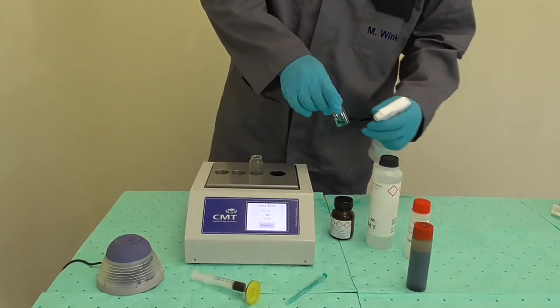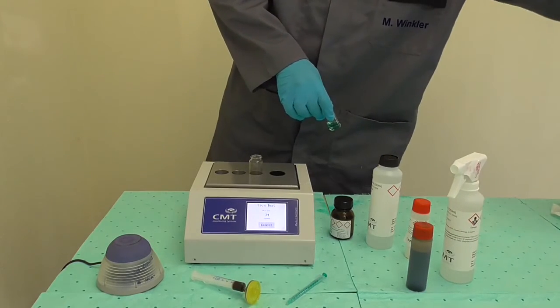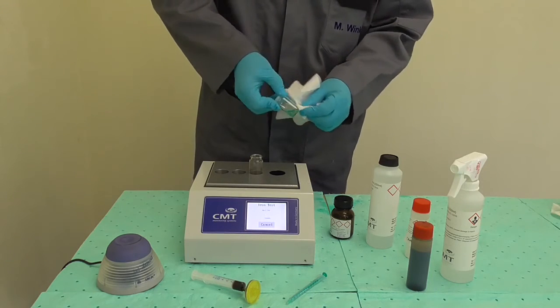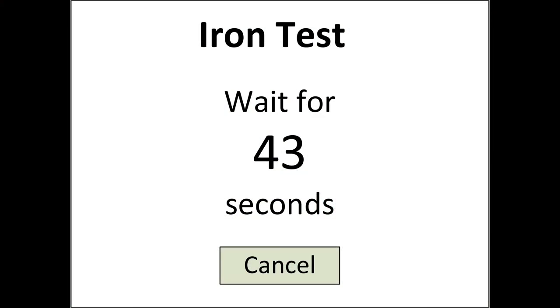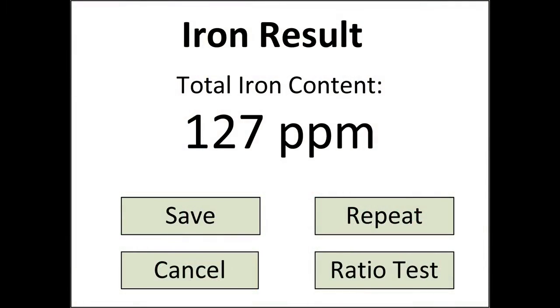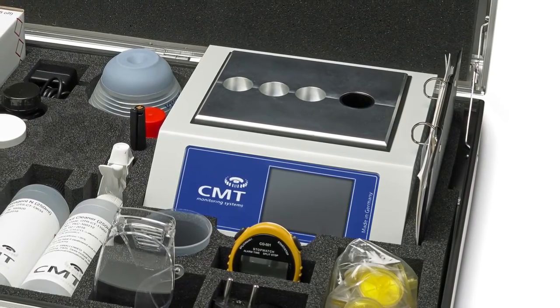In the meantime, clean the vial from the outside with some vial cleaner and a clean paper towel. Wait for the 45 second counter to be finished, then place the vial into the measuring chamber. The results will be displayed on the device.